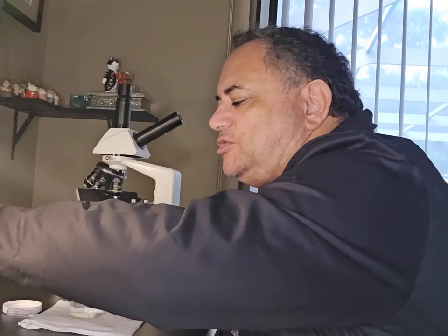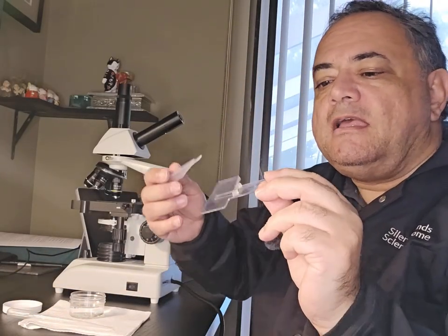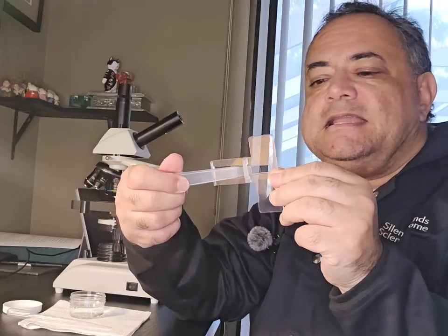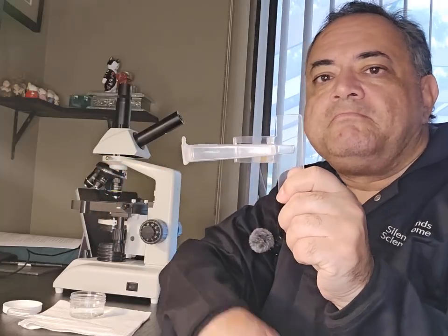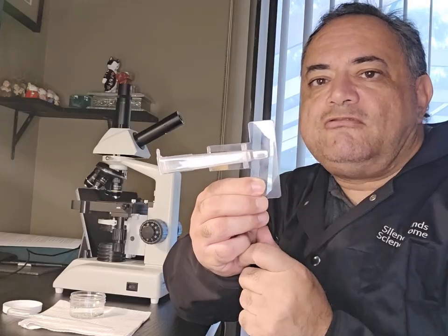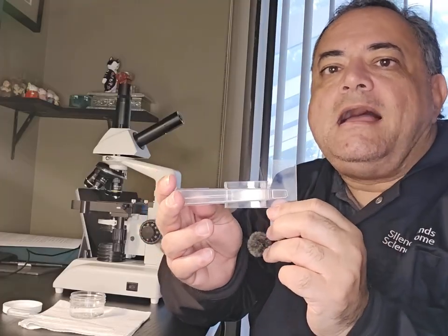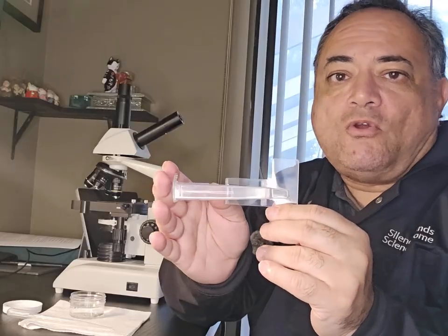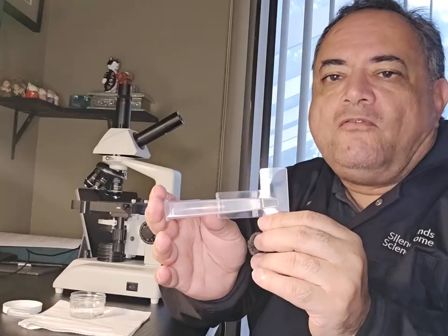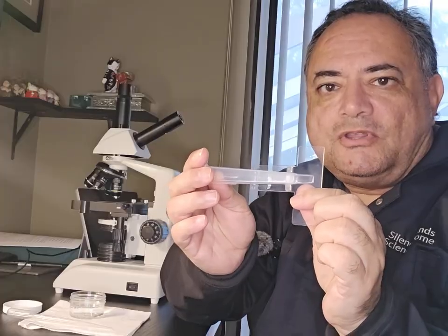And there's an adapter that you put on your microscope stage. This is the adapter, and basically the demo slide slips in, like so. This viewing area is what you view under the microscope. The only drawback is you cannot go under high magnification. You can only really use low magnification, but that usually is enough, and it certainly is enough for looking at tardigrades. So this is what I'm going to use today to view the tardigrades.